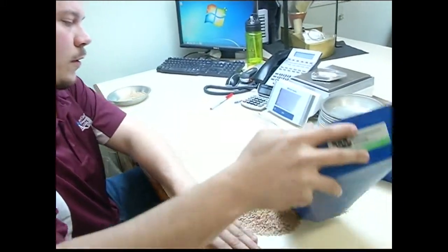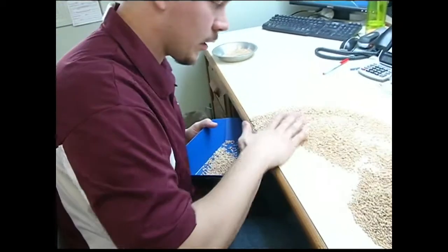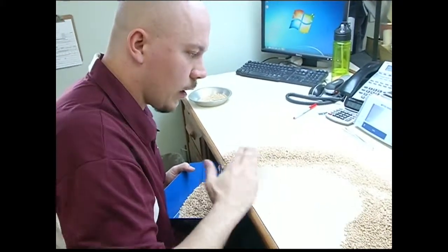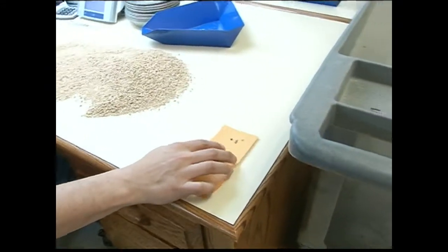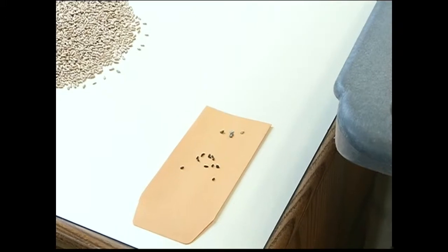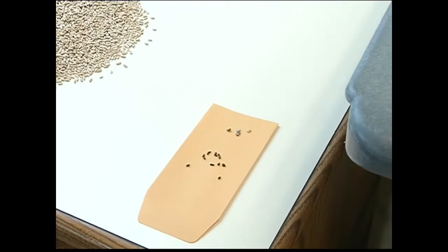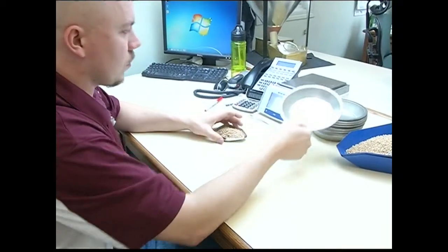And then I will pour it out. Probably missed that. So then I'm going through this and just kind of sweeping through, checking for, like I said, stones, rodent pellets. As an example, this is what I found in this sample. It's a whole bunch of rodent pellets. We got some stones in there. If there's over 2 rodent pellets in a sample, it'll make the sample go sample grade, which is not for human consumption.